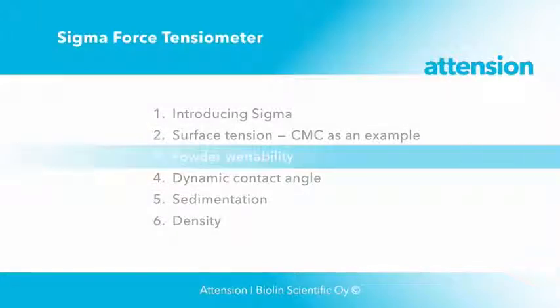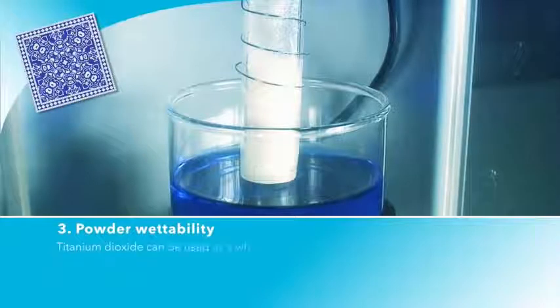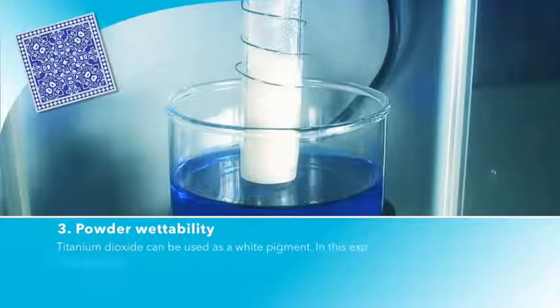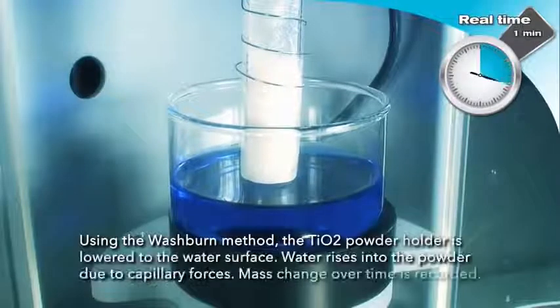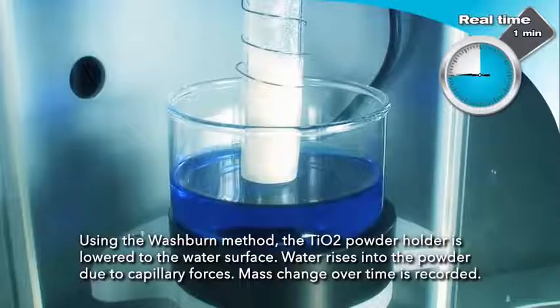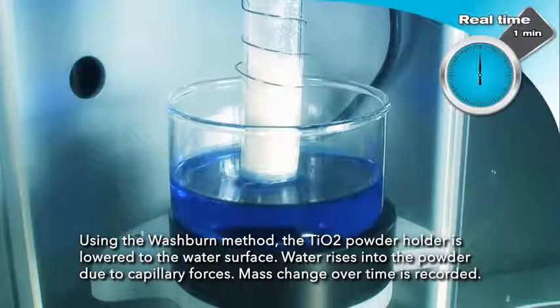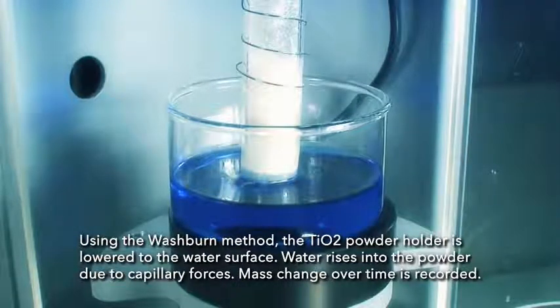Next, we will measure powder wettability. Titanium dioxide is often used as a white pigment. In this experiment, we are investigating differences in wettability between two samples from different providers. Using the Washburne method, the titanium dioxide powder holder is lowered to the water surface. Water rises into the powder due to capillary forces and the mass change over time is recorded.